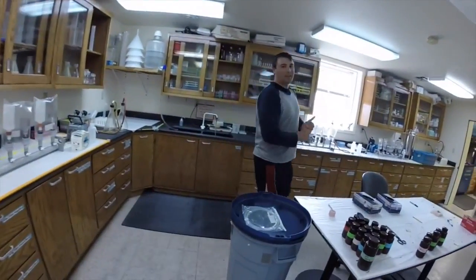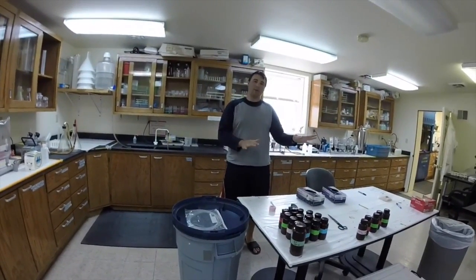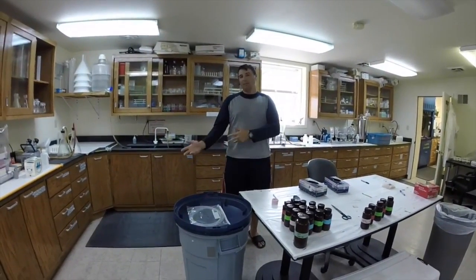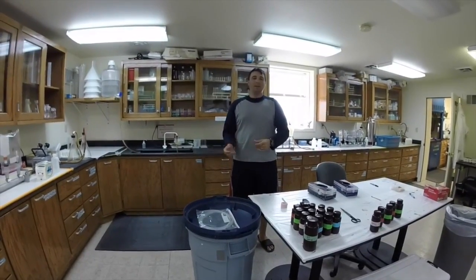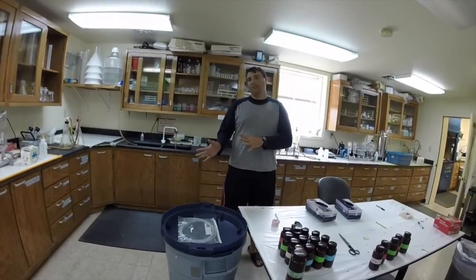This is the filtration lab where we do all of our water work. When we go out on the lake, we get water samples and bring them back here to filter them for various tests. They get sent back to the Ann Arbor office where they analyze the data.